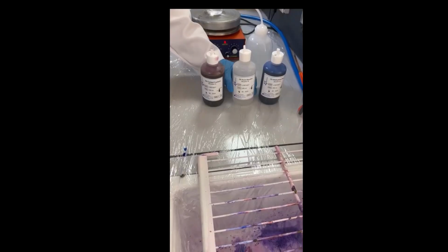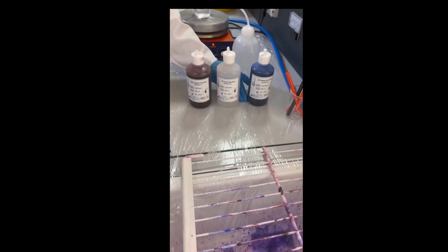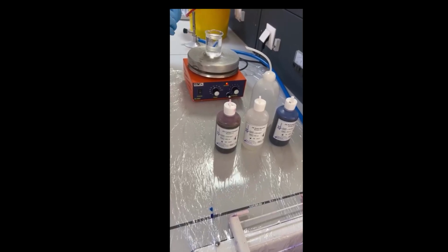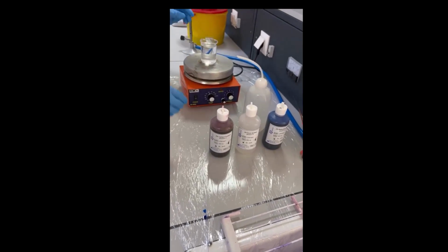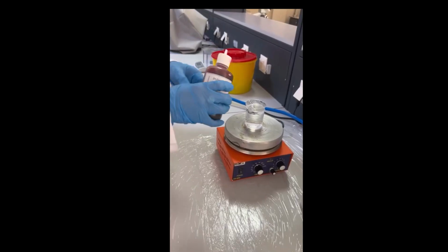Then we add the acid alcohol drop by drop for about 30 seconds, and the counter stain is methylene blue. First of all, I put the beaker on a hot plate because I need the steam before I add the first stain, the primary stain. Then I will add the primary stain, carbol fuchsin, for about 5 minutes.